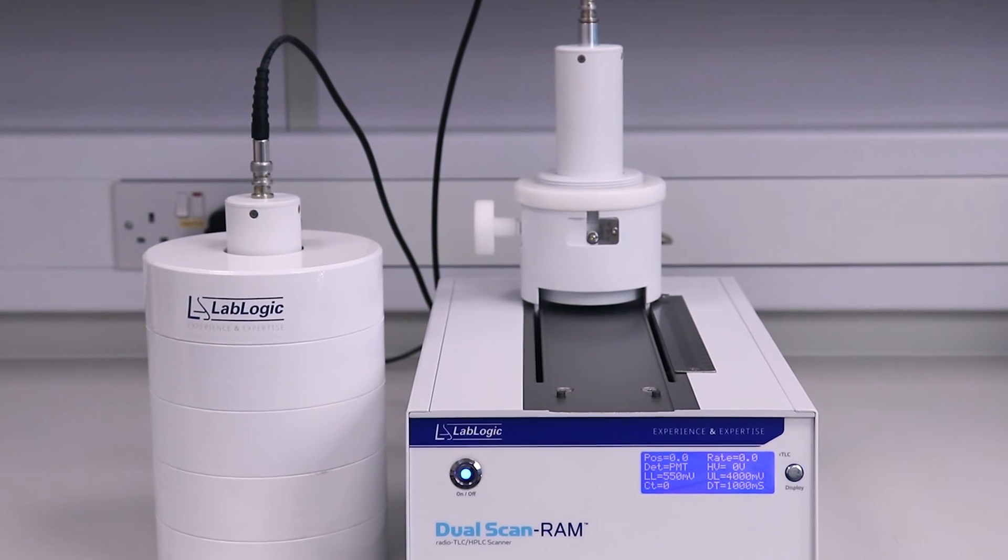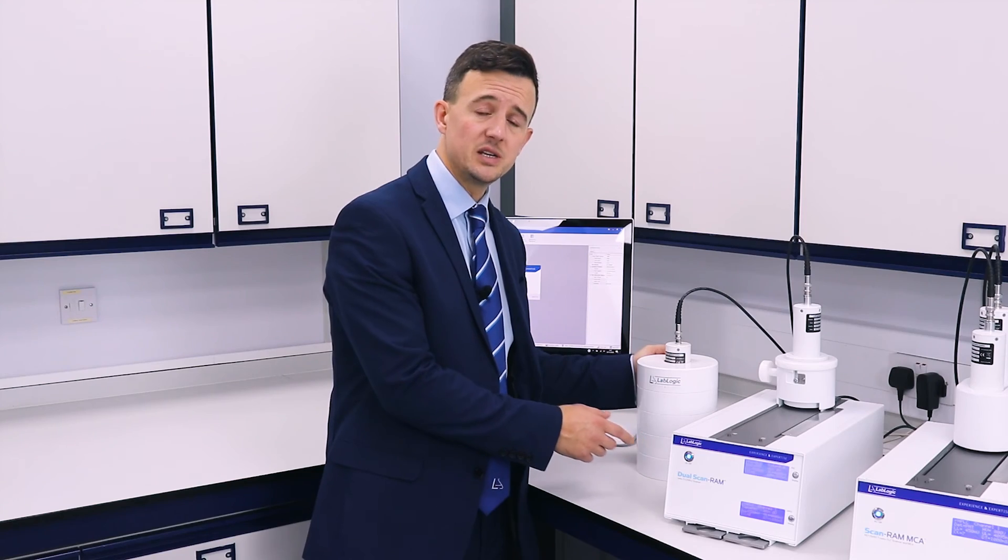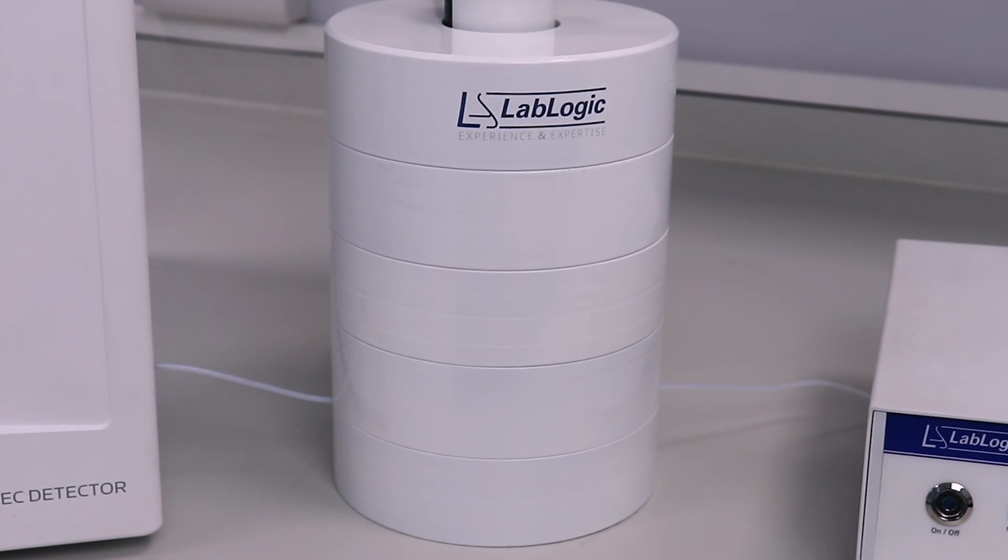The radio HPLC unit has a second detector which sits inside a lead shield. The eluate line from the HPLC runs through the lead shield and is measured by the detector.